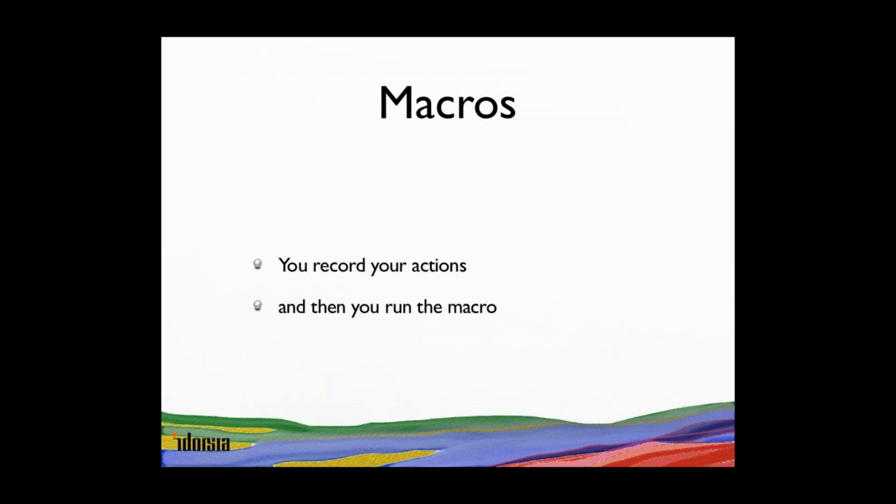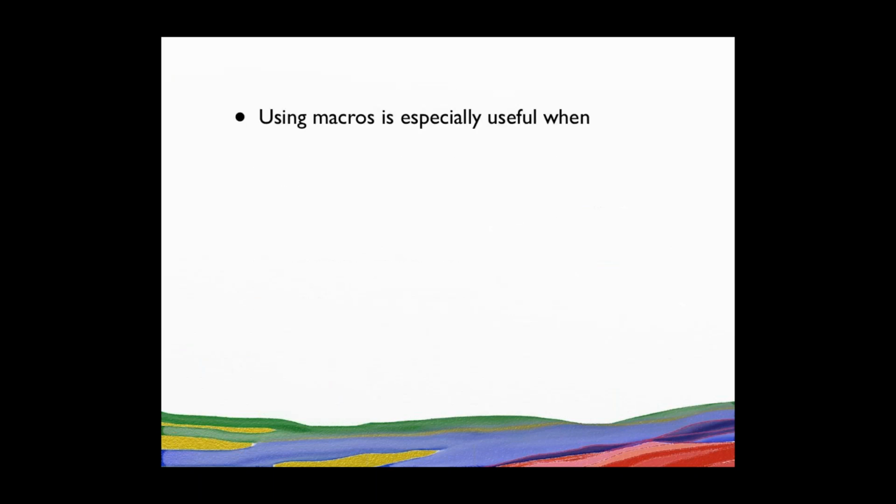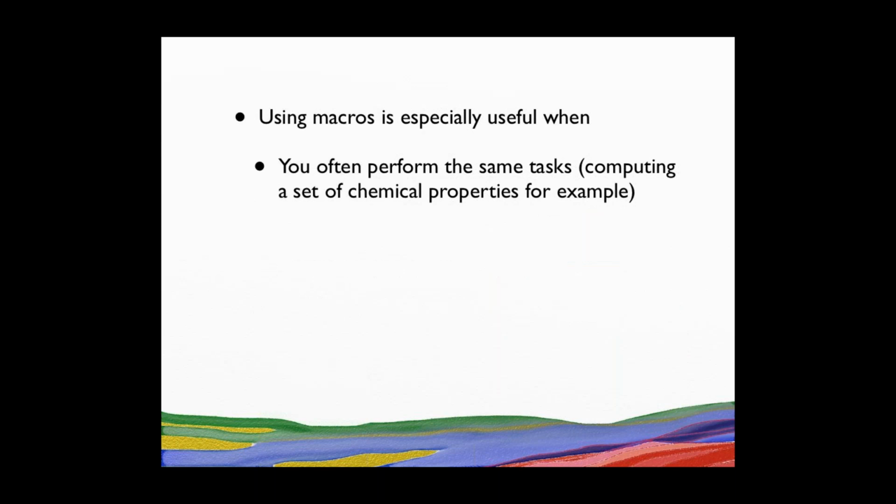Okay, macro. Basically you record your action and then you run the macro. But the nice thing to do is also to be able to edit them and also to export and to import them.